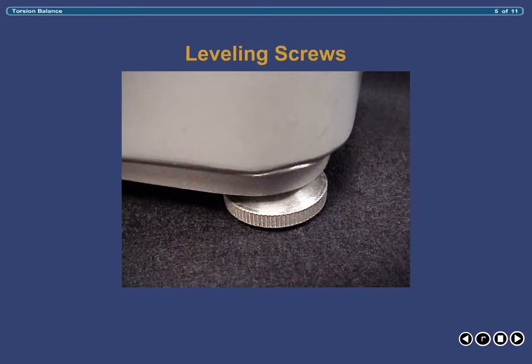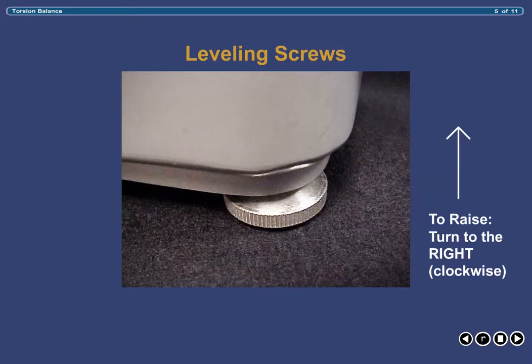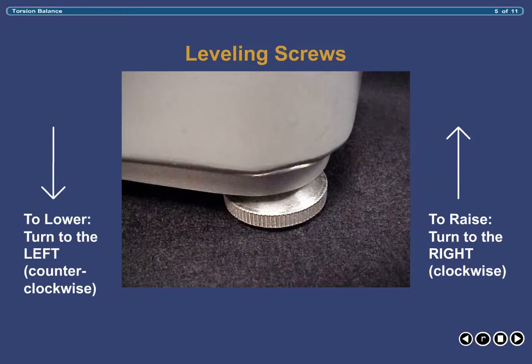The two leveling screws are located on the front, underneath side of the balance at both ends. These screws allow you to ensure that your balance is level prior to weighing, which is a necessity for accuracy. By turning the leveling screw clockwise, you will raise that side of the balance, and by turning it counterclockwise, you will lower that side. An easy way to remember this is the phrase: turn right to raise, and left to lower.